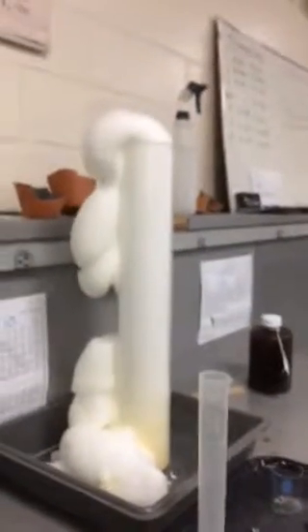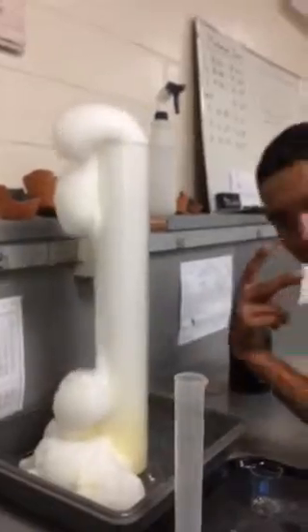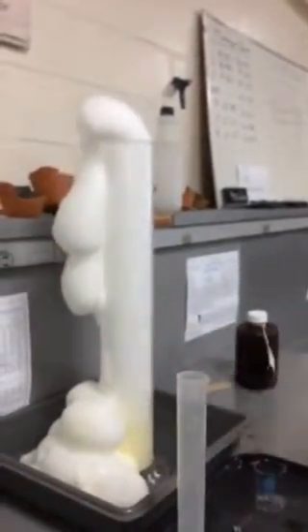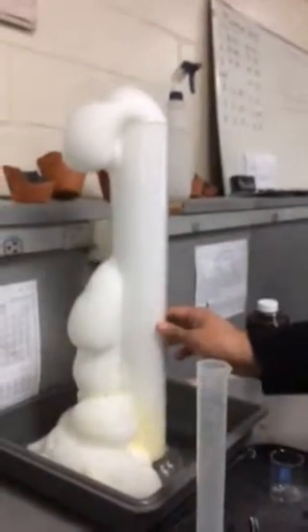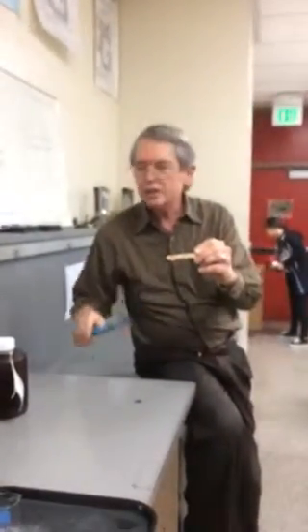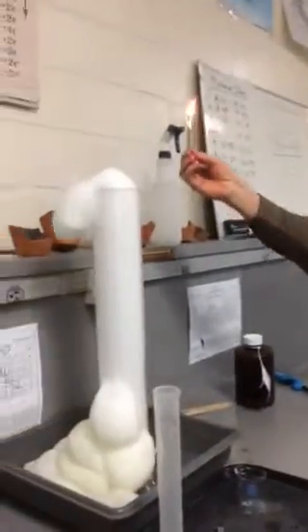What we want to do, got to get my lighter. Yeah. You feel the heat? Yeah. And you can see some vapors coming out of that as well. And the color of the iodide ion changing into iodine in the presence of the oxygen is what's making this stuff happen.